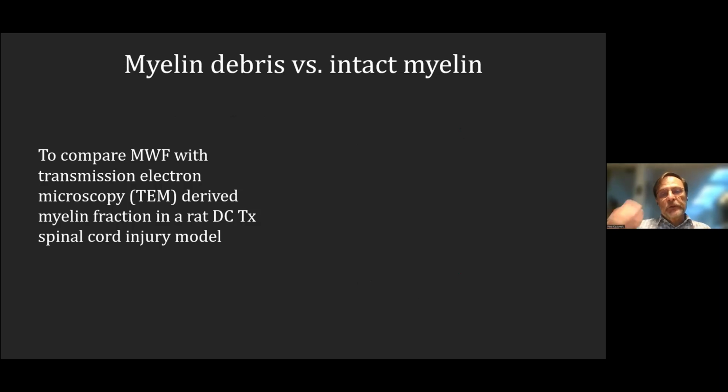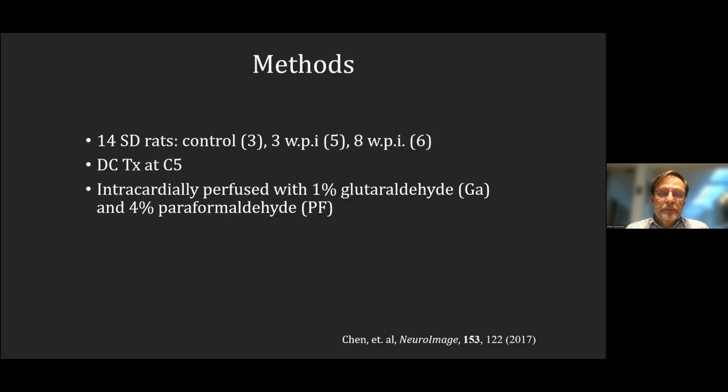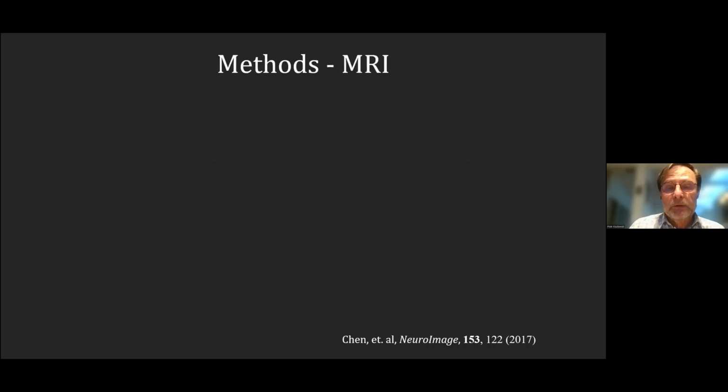So the question was, is myelin water imaging good enough to distinguish between the debris and the intact myelin? So we did a study looking at this specific case, where we looked at the control cohorts, 3 weeks post-injury and 8 weeks post-injury, and we did both the myelin water imaging and the electron microscopy study.